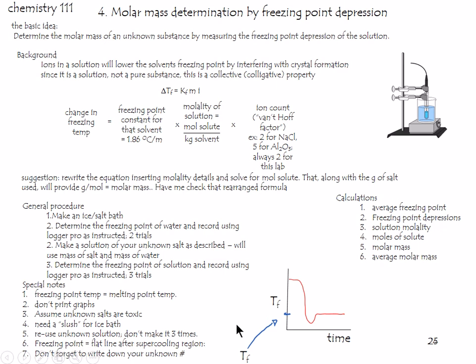The freezing point is actually when you measure it on a graph, not just equal to the lowest point on the curve, because at that point it hasn't frozen yet. Things usually supercool a little, and then the temperature goes up. This may be due to the fact that freezing is an energy releasing process. But the bottom line is that you want to measure this bottom line. This bottom line, as it's flat, does give you a nice indication of the freezing point of the solution. So that's what you want to get for your freezing point.